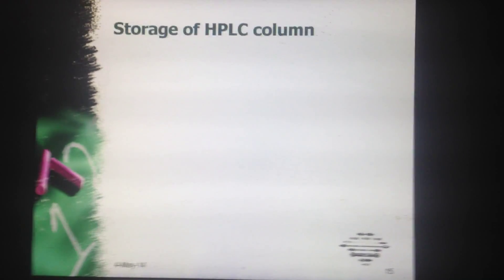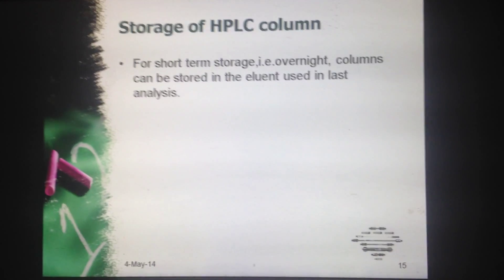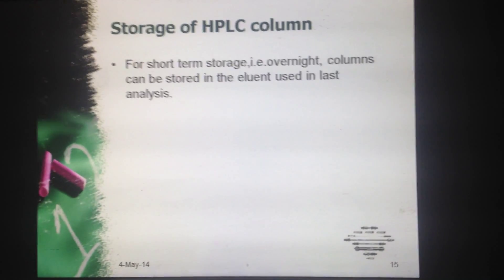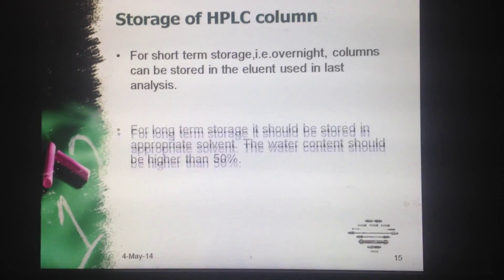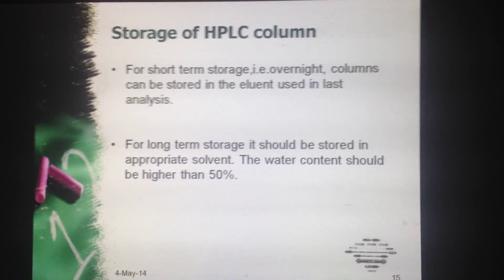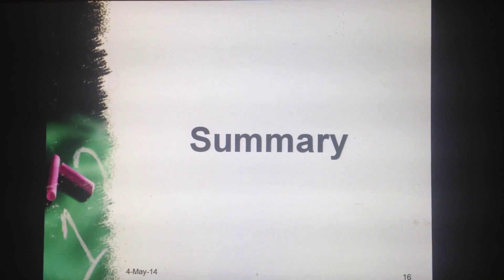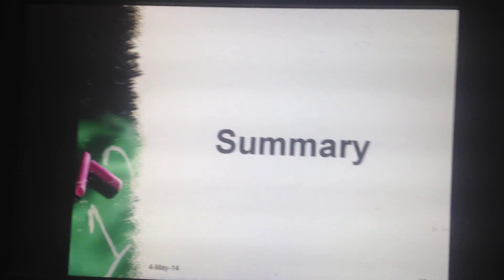Now what are the storage conditions for an HPLC column? There are two types. First is short-term storage: for overnight storage, columns can be stored in the eluent used in the last analysis. For long-term storage, it should be stored in an appropriate solvent, and the water content should be higher than 50%.